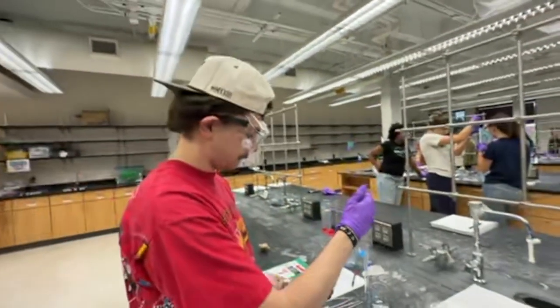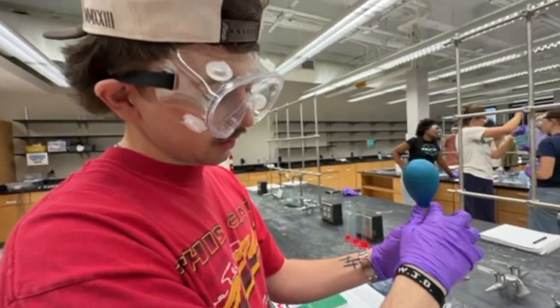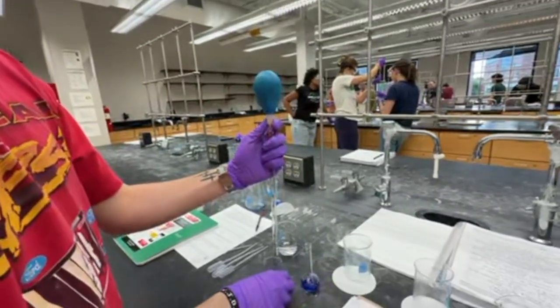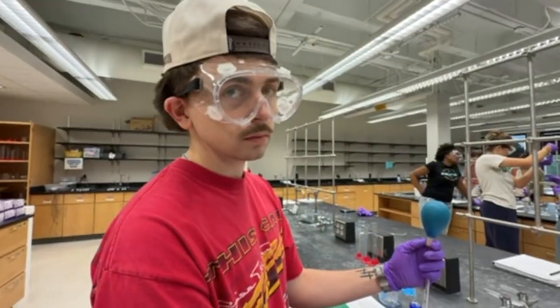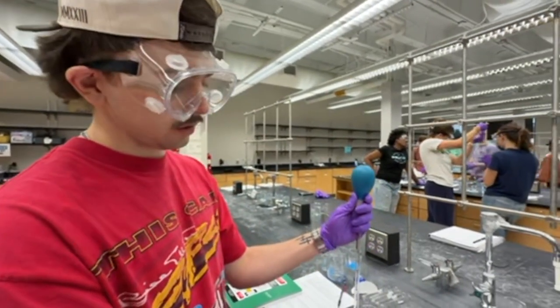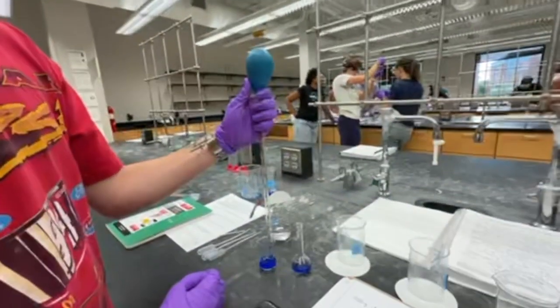So you've got to explain initial and final volume. My initial volume in the container was 0, so there's nothing in there. And now the final volume is 5, after putting 5 milliliters of the solution in the flask. The whole pipette holds 10. I filled up to the 5 line. 10 minus 5 is 5. There's 5 milliliters in there.